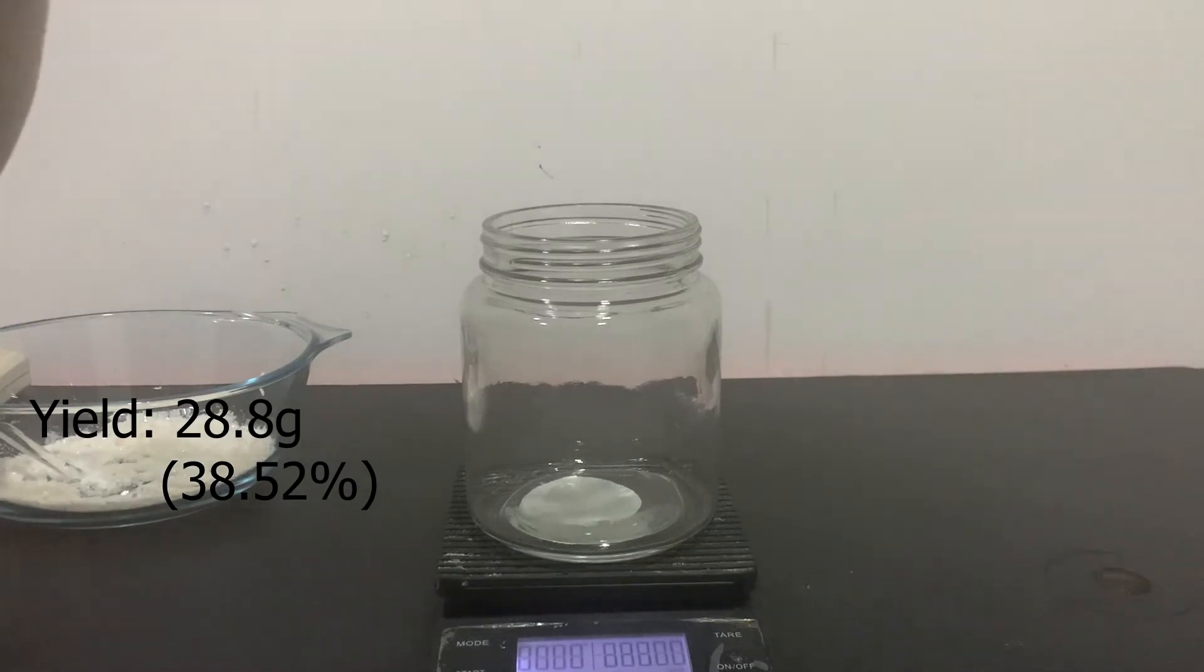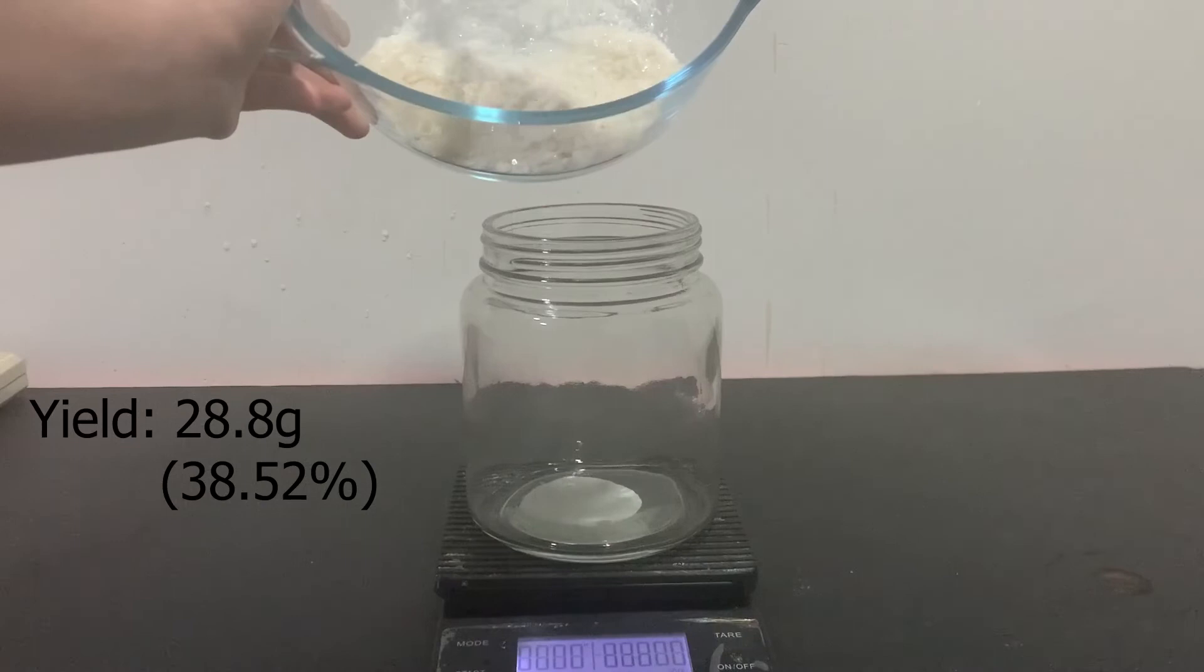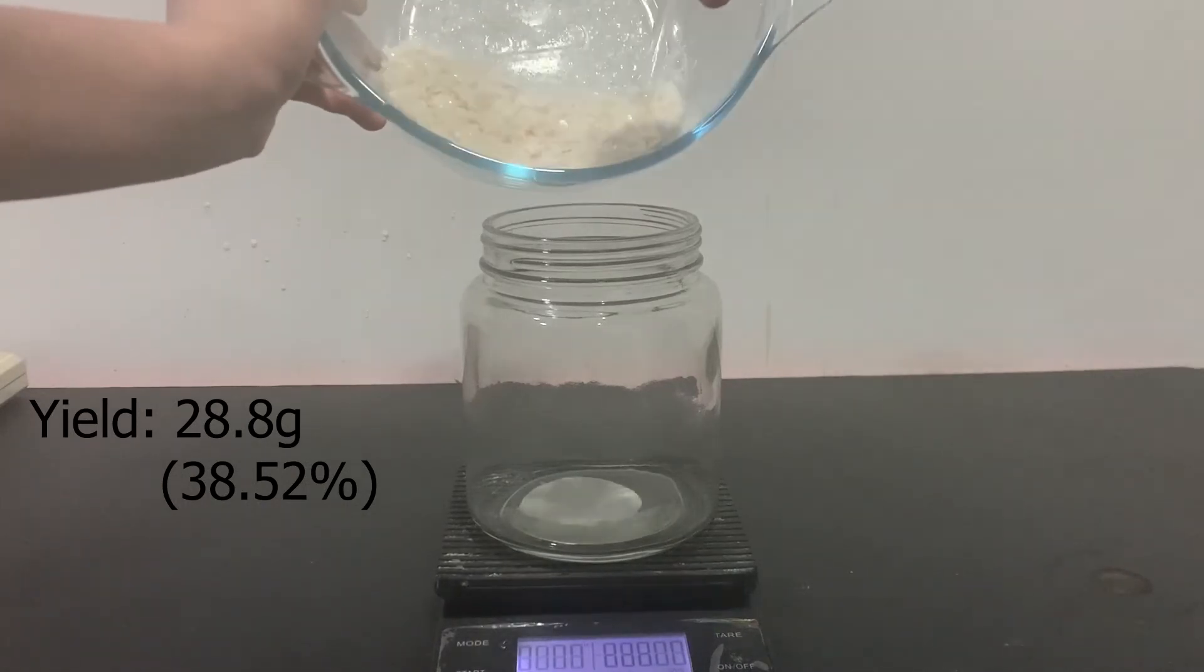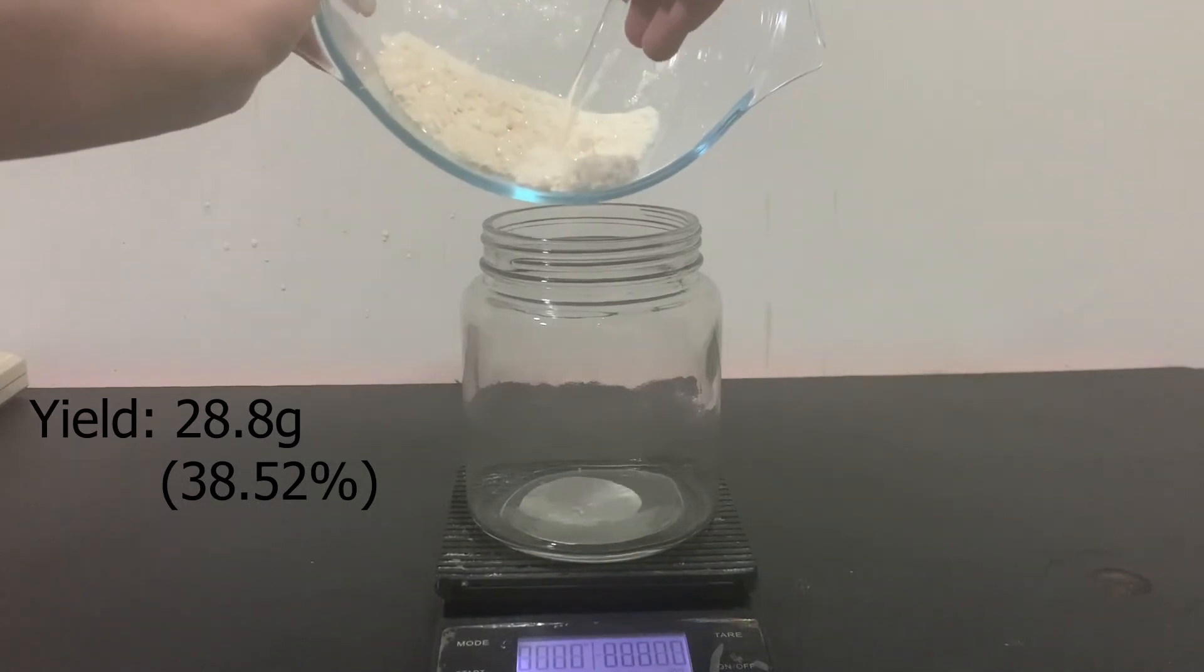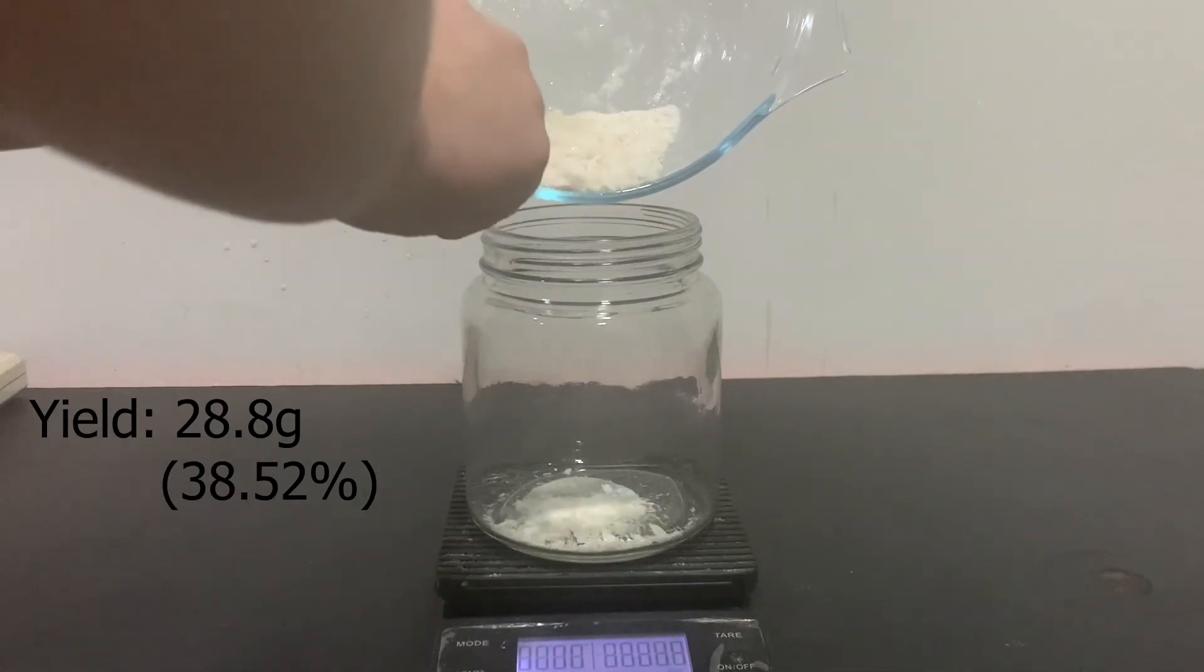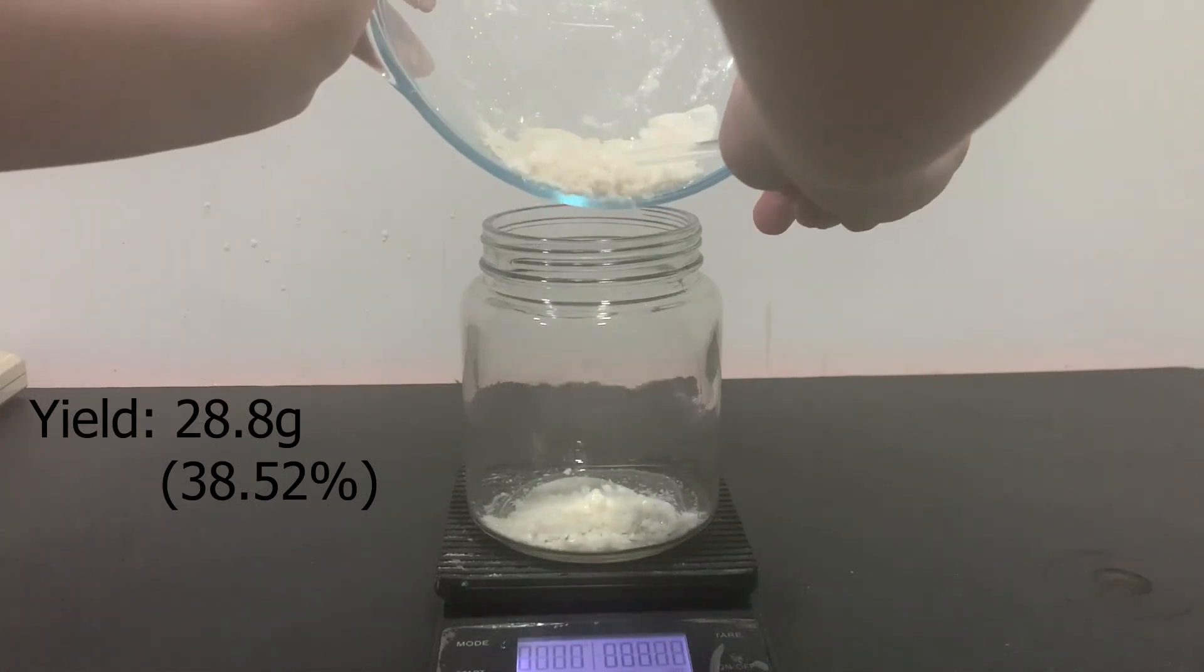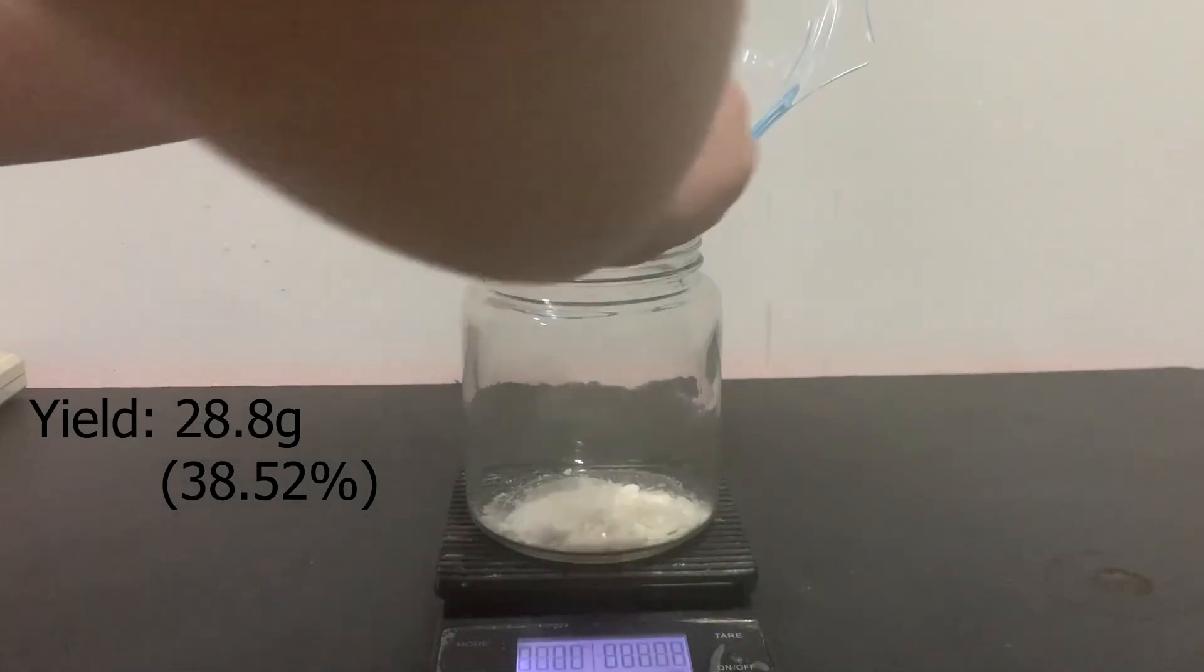I then measured the yield of acetanilide. The yield came to be low at 28.8 grams with a percentage of 38.52%. The yield could be improved if the reflux was allowed to continue overnight and if I also had not tried to filter the solution.